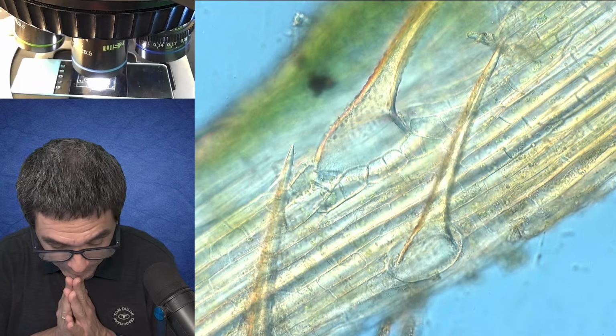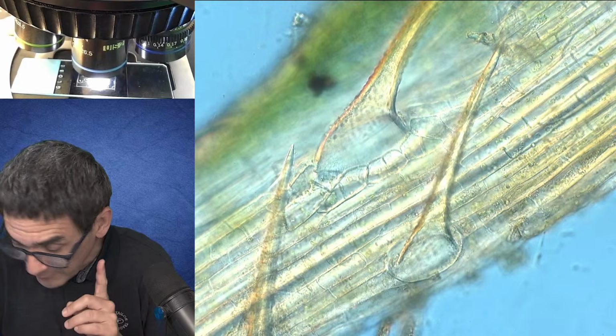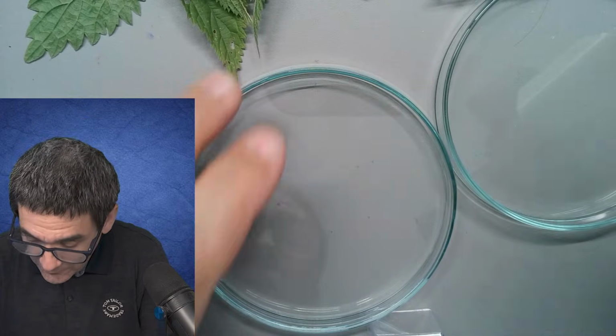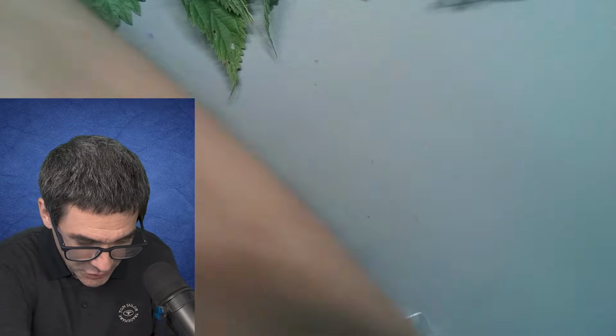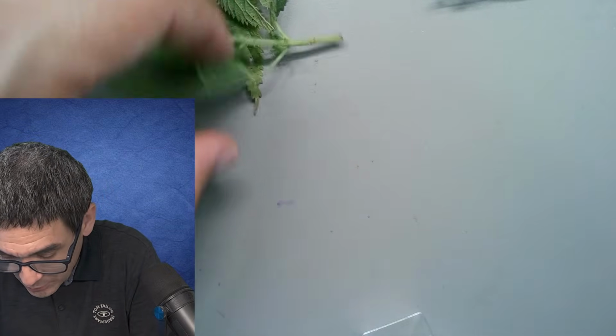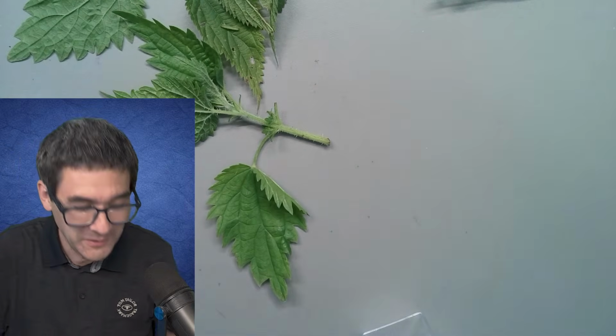So, you know what? Let's try the painful thing. Let's try to make a cross section, okay? Honestly, I have also not made a cross section yet of a stinging nettle. Sometimes it's also one of the reasons why I like doing this live stream, because I also get to do things that I normally wouldn't do.